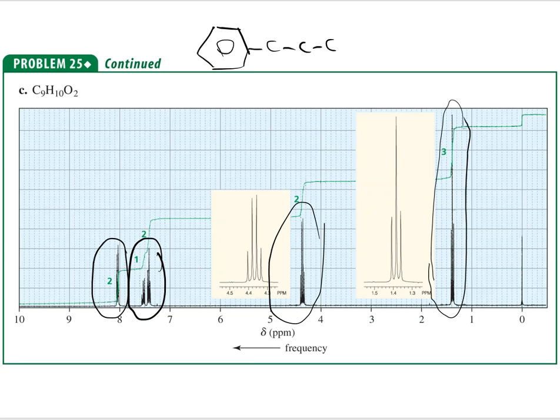It looks like we have 2 oxygens here. Oh, okay, so that's something that I didn't anticipate, right? So these 2 oxygens, well, it could be like a C double bond O and an O. That's an option for 2 oxygens here. Or it could be a C double bond O with an OH group separately somewhere else.